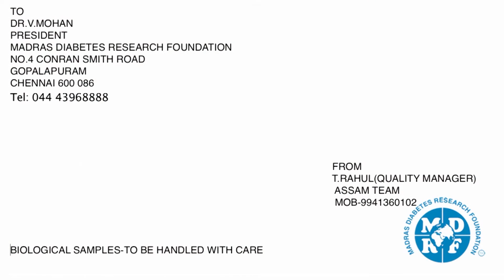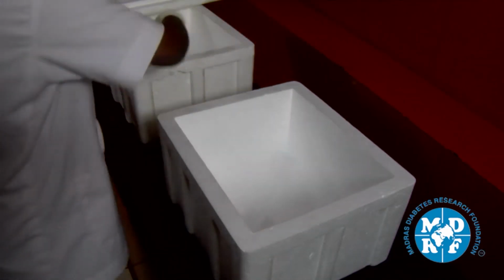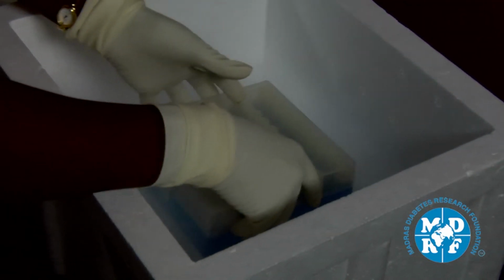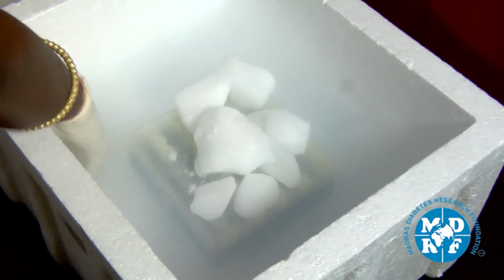The address label should contain the following particulars: the printed address of MDRF, phone numbers with area code of MDRF and the instruction to handle with care. The address labels should also contain the printed label, biological samples on it. The samples in cryovial box are then to be placed within the dry ice lined thermocol box. Dry ice is then placed on top and sides of the samples.